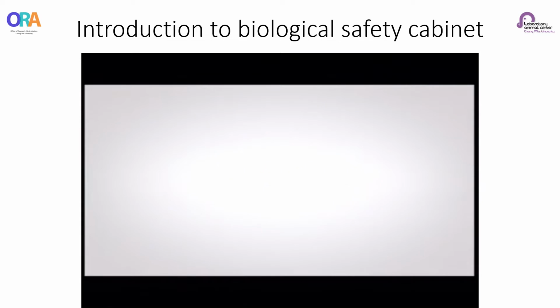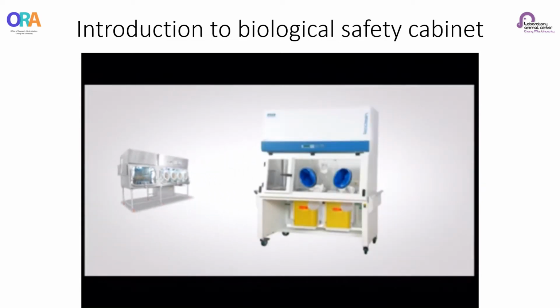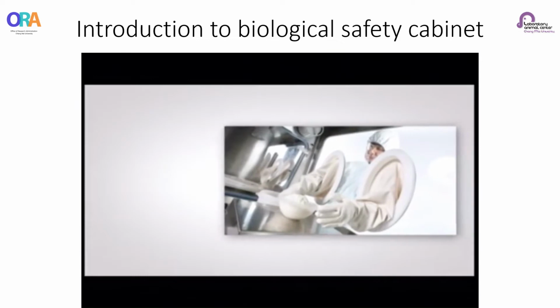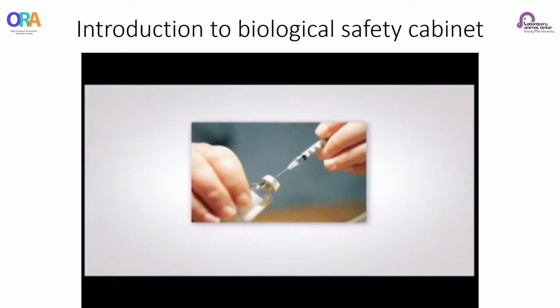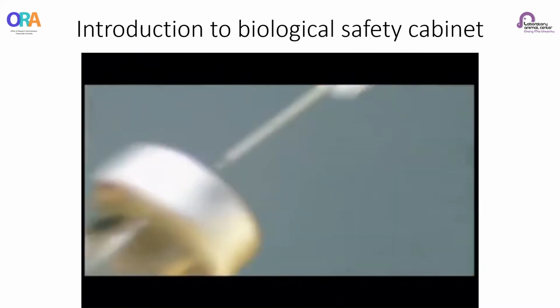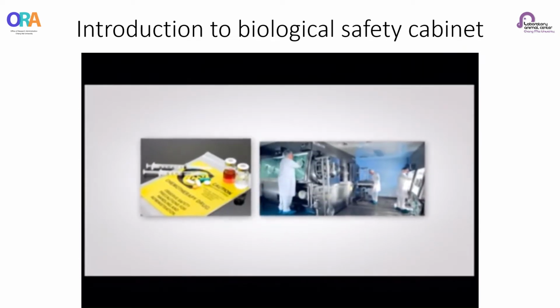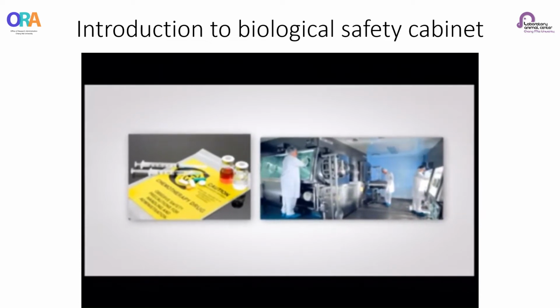Isolator. An isolator is a type of enclosed ventilation system that has physical barriers. Internally, it provides a workspace which is separated from the surrounding environment. There are positive and negative pressure isolators. Positive pressure isolators can be used for the aseptic preparation of pharmaceutical products, while negative pressure isolators are used to protect the operator from hazardous materials such as cytotoxic preparations.